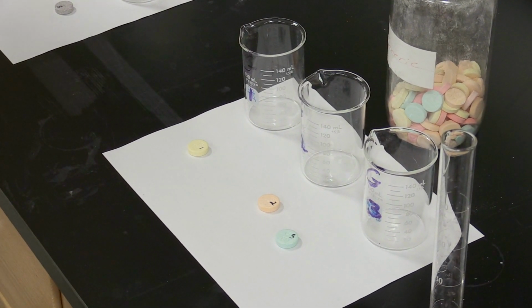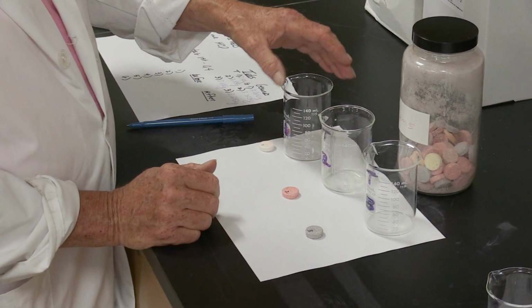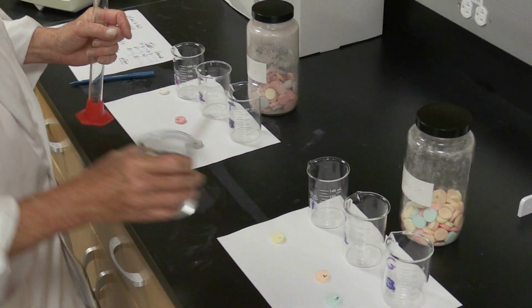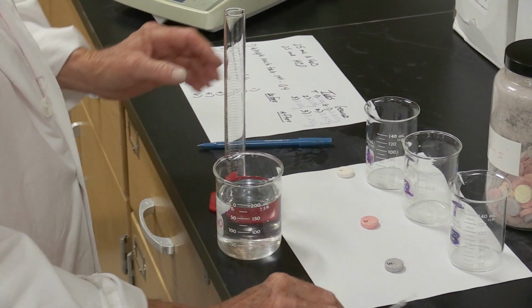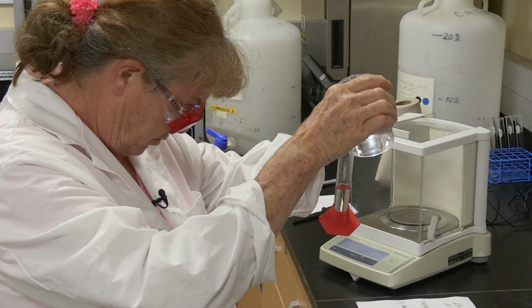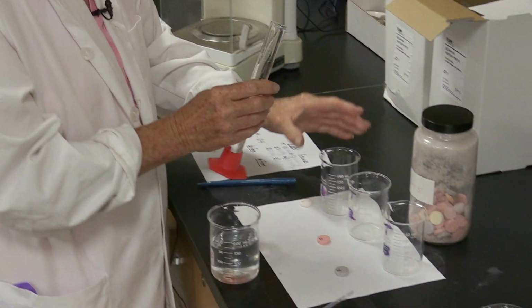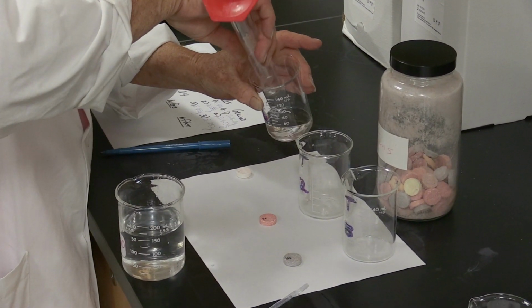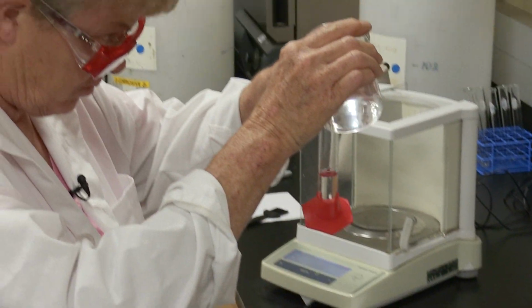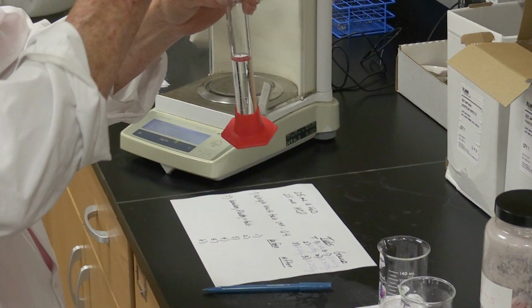That's it. The next step is to add 25 mils of acid and 25 mils of distilled water to each beaker. So let's do the water first. Perfect. Adjust it with a pipette.